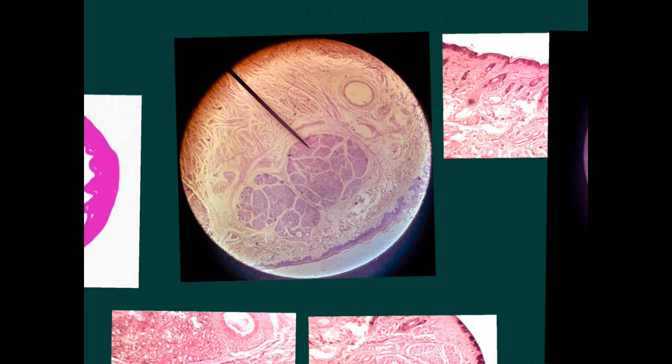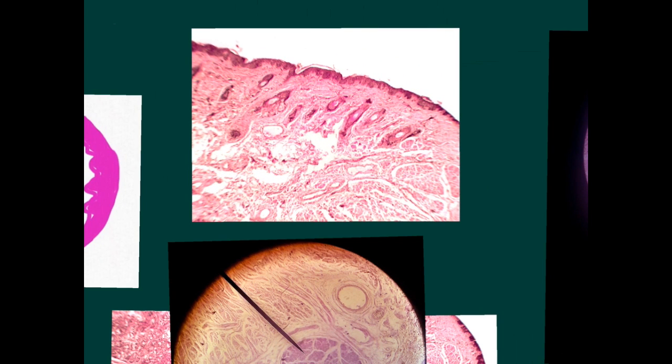Also, this is the skin side of the lip with the hair follicles. And this is the margin here. This is the margin devoid of the hair follicles, and you can see here the muscle layer. And also look at the mucous membrane here, and these are the glands.